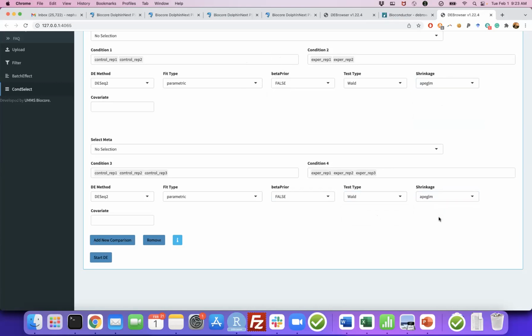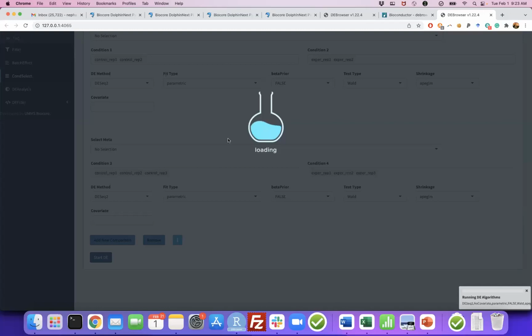When you do your GSEA analysis, for example, for functional analysis like GO term analysis, sometimes you need to have your list sorted using a statistics method called Wald statistics, for example, or another LRT is fine too. But this works best for me when I use GSEA, GO term, or functional analysis programs, because you can sort it using that test. And I'll tell you more a little bit later.